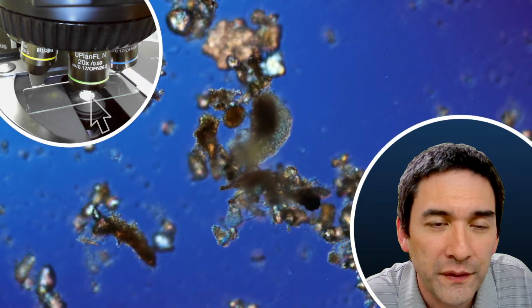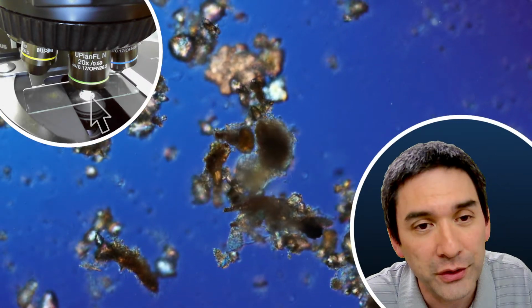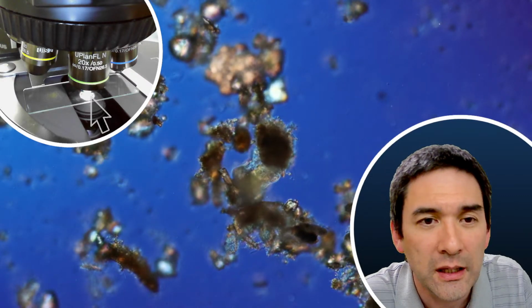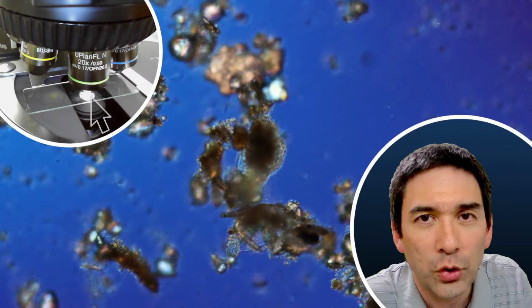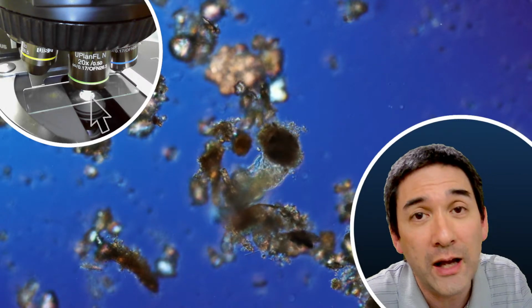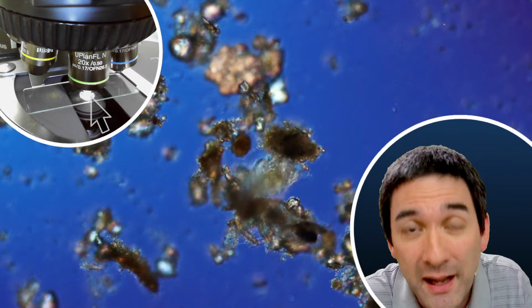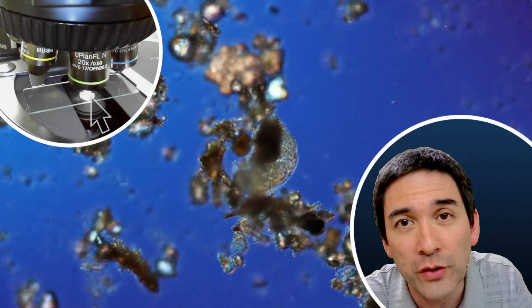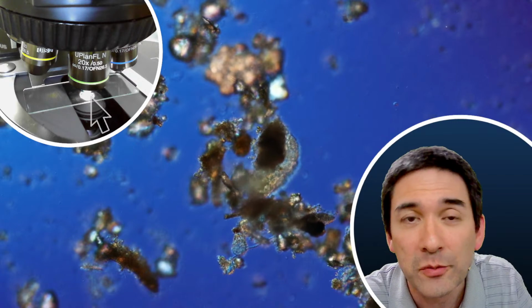I've not done this myself, but I remember from university that if you want to check the water quality of tap water, you have to concentrate it by passing the water through a filter and then observing the filter. Otherwise, the concentration of microorganisms might be too low.